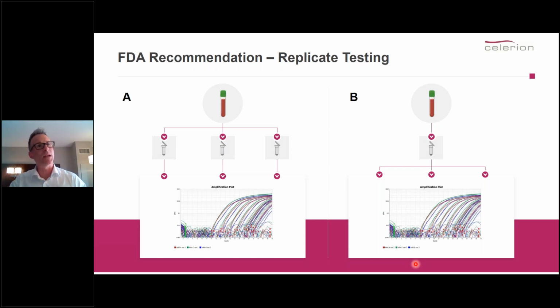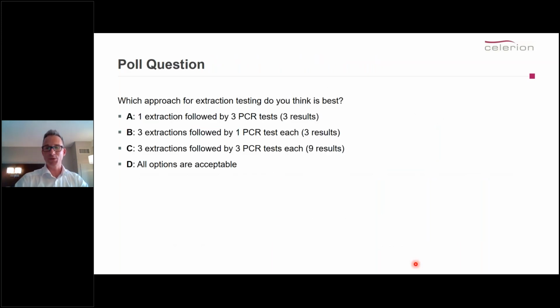It's a balance between how much effort you spend on the method and the PCR, so what your throughput of the sample is going to be in the end. But yeah, 39% think so: 3 extractions followed by 3 replicates. So the throughput per plate per sample is then obviously massively decreased. But yeah, good to hear. Great to know. I'm glad I get your input, your thoughts on here. It really helps shaping the experiment and also knowing about the expectations generally out there.